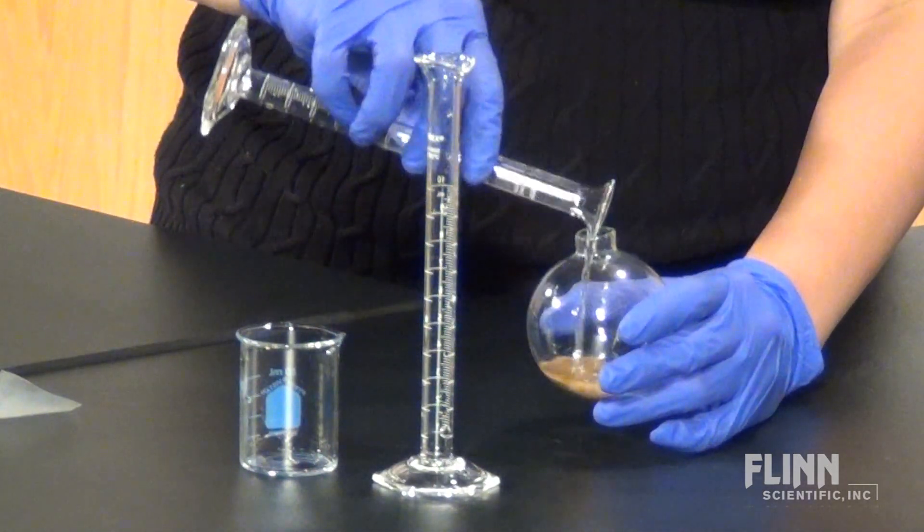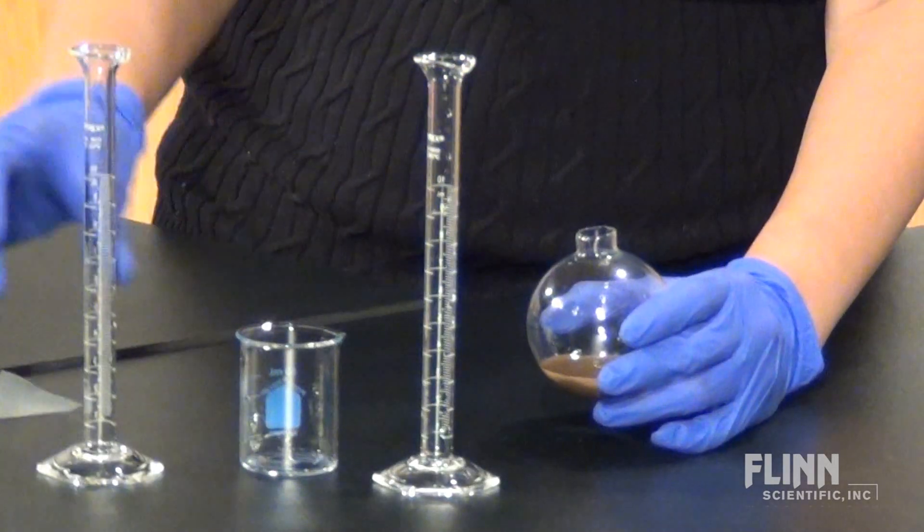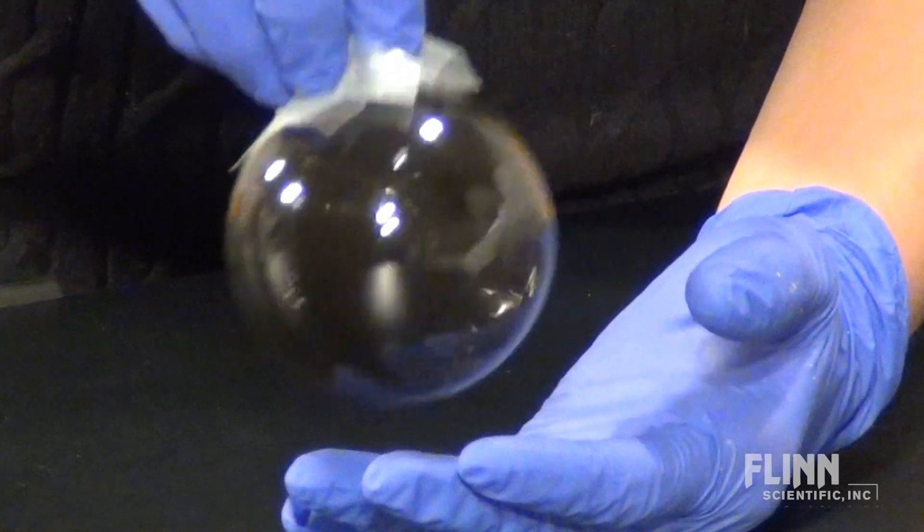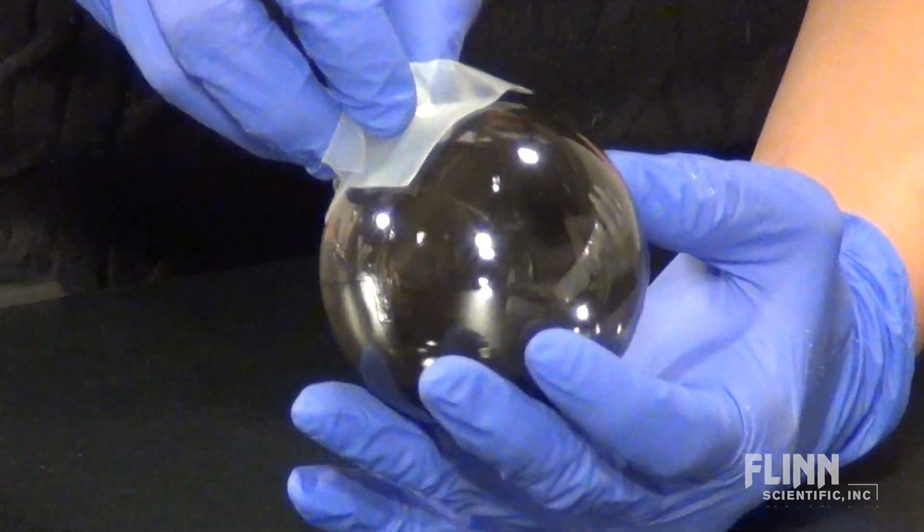Cover the top and gently swirl so the solution covers the entire surface. The dextrose reduces complex ions in solution to form silver metal, which covers the surface of the glass.